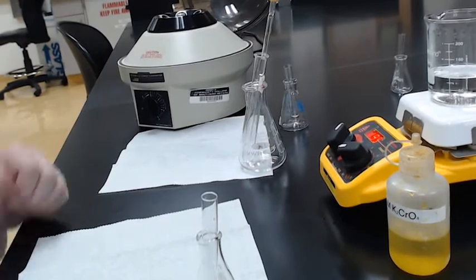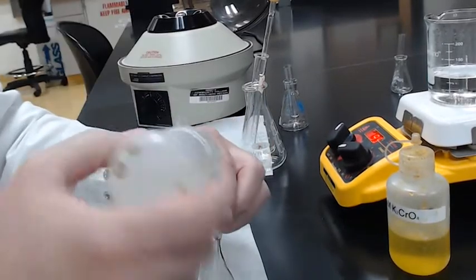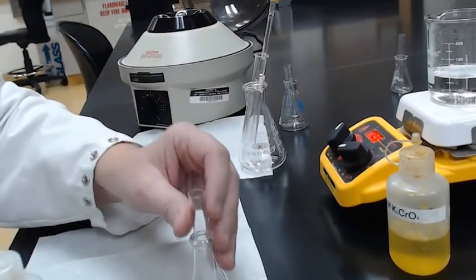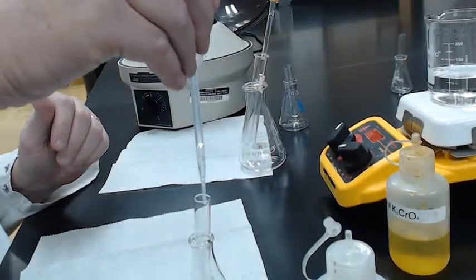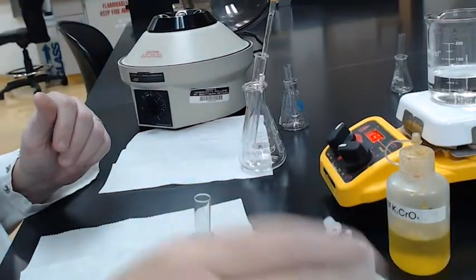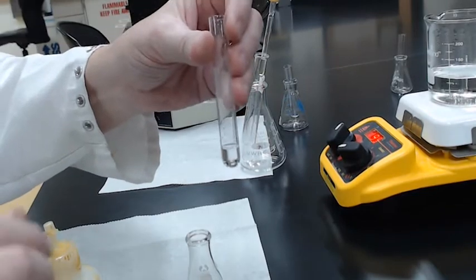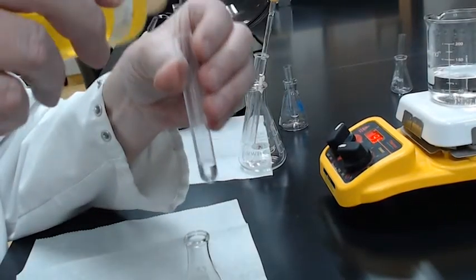Okay, we're going to then add some acetate. And what we're doing is we're making an ammonium acetate buffer. It says to add 1 drop of the 5 molar acetic acid. So we added a drop. And then we're going to add 4 drops of water. 1, 2, 3. 1 more drop just to be sure. Okay. And lastly, if there's barium, when we start adding the potassium chromate, the clear solution should start turning cloudy. If there's no cloudiness, it means no barium. If there is cloudiness, we should have barium.